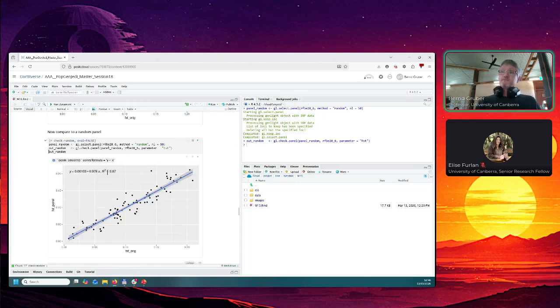And you can see it's not too bad, but random obviously is not as good as before. So maybe you could start playing a little bit. Okay, maybe I get away with 40 SNPs using the DAPC method. So I saved a little bit. And then you could do, okay, that's FST settled.